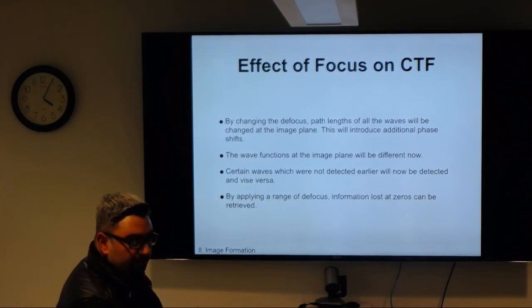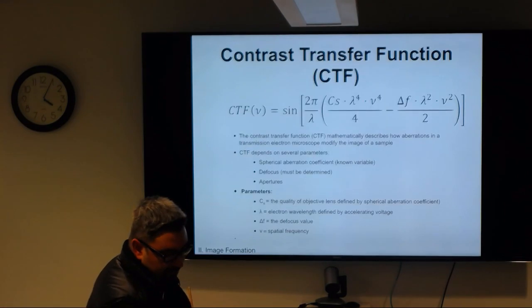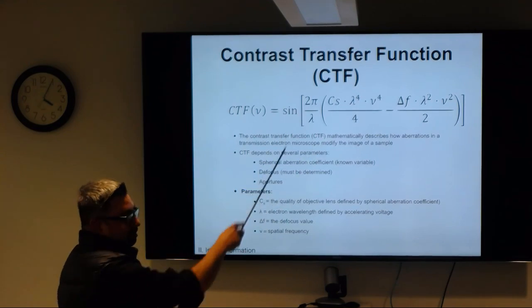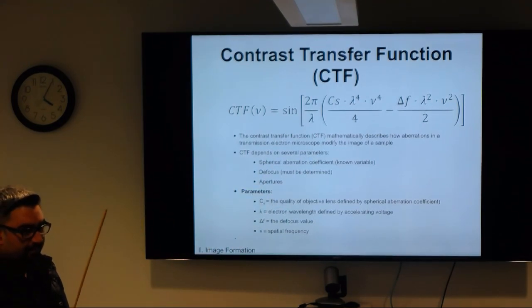You mentioned the aberrations of those. Well, the aberrations all contribute to this. Defocus is an aberration. Spherical aberration, chromatic aberration. There's astigmatism, which is defocus corrections, and then there are higher order aberrations.